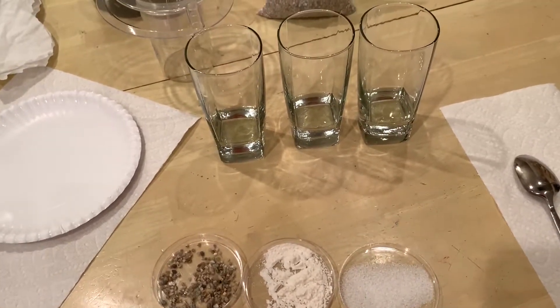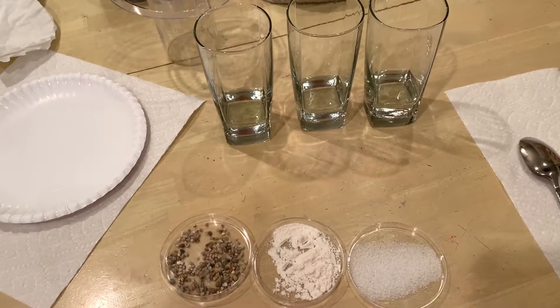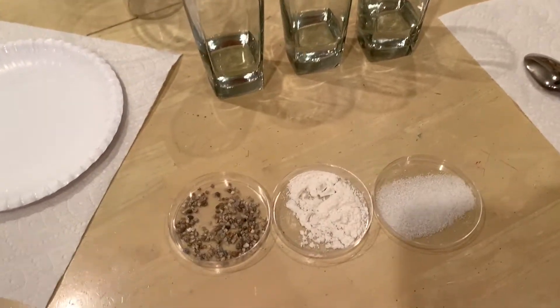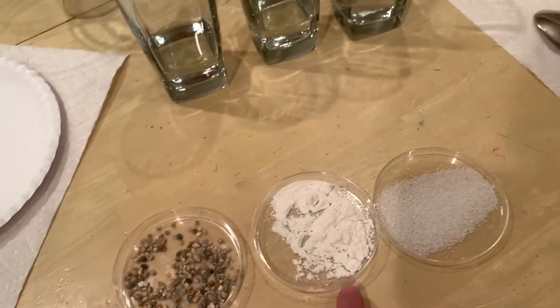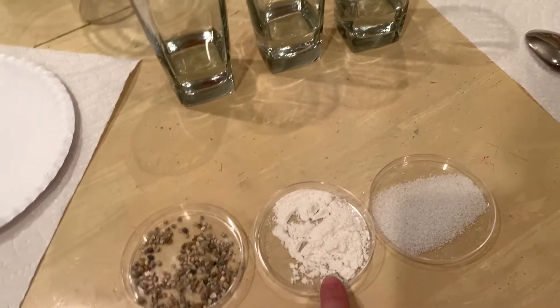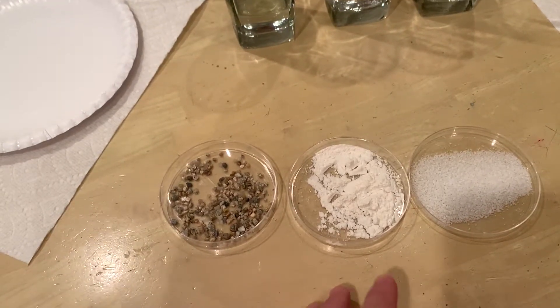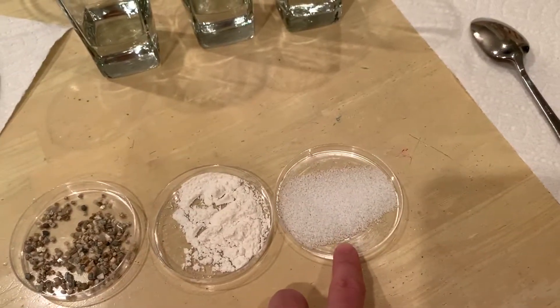Today we're going to work on mixtures and how to separate mixtures. I have three petri dishes set up. The first one has gravel, the second one has flour. The lab says to use diatomaceous earth, but since we're not in the classroom and I didn't have any, we're going to use flour and regular kosher salt.